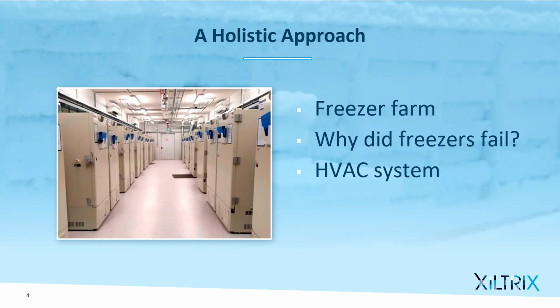Even though the freezers are functioning correctly, they're dissipating a lot of heat. And on multiple occasions, you see that the HVAC system is not performing in a regular fashion. There might not be maintenance done regularly, or there are just downright too many devices crammed in a room that doesn't have enough heat or cooling capacity available.